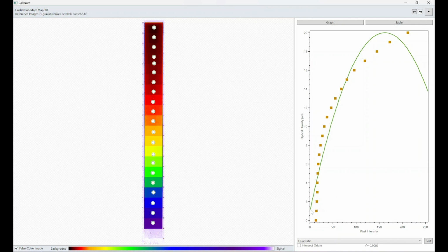So as you can see, this is the line of best fit, and we've got a number of different calculation methods that we can use mathematically to work out what our line of best fit is. Because obviously, if you have a pixel value between your 2 sampling points, it has to be extrapolated from the information that the program's been given. So the line of best fit and how your step wedge should be calibrated, used and set up will be included in the information that you get from the manufacturer from whom you've bought your step wedge.